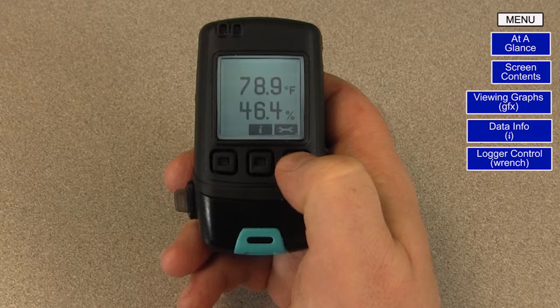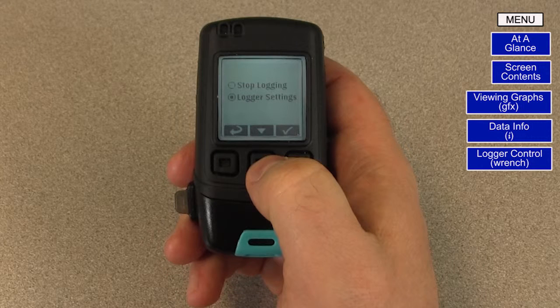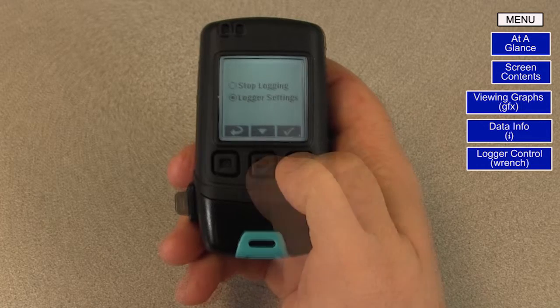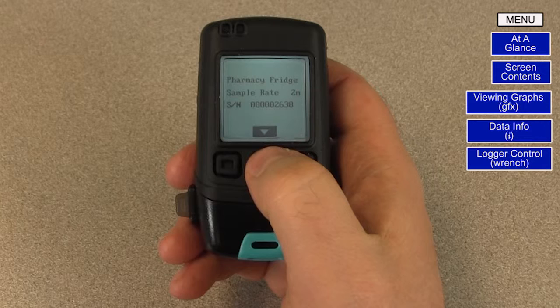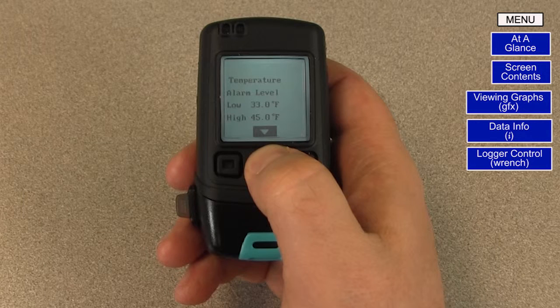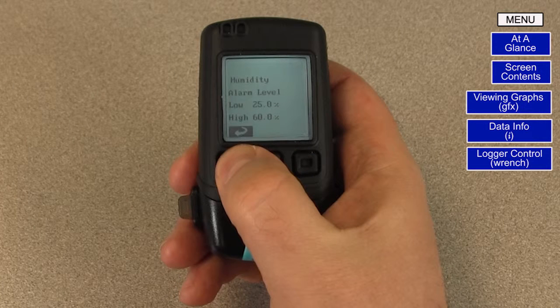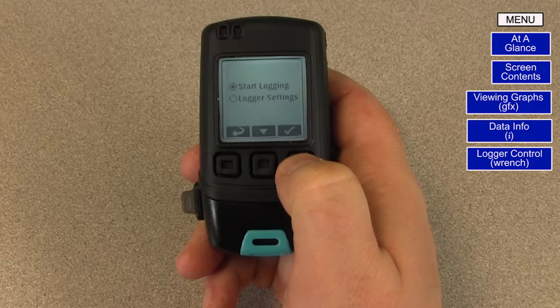One option we have not looked at is Logger Settings. Press the button under the wrench twice if the backlight is off, press the button below the triangle until Logger Settings is selected, then press the button under the check mark. You can now review the current configurations of the data logger such as the name of the unit, sample rate, and serial number. If you continue to push the button below the triangle, you will see the alarm settings for temperature and humidity. When you have reached the final screen, press the return arrow to go back to the first list of options.